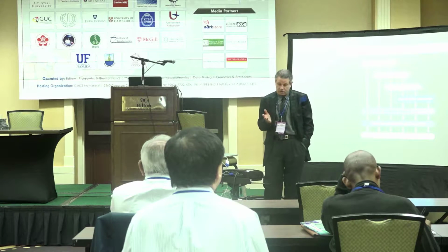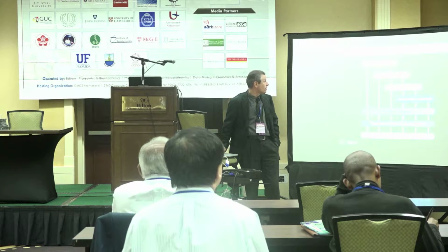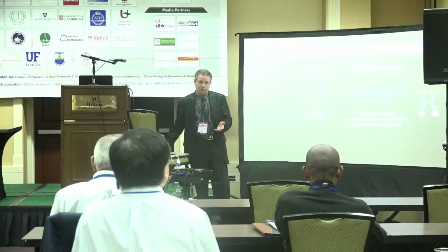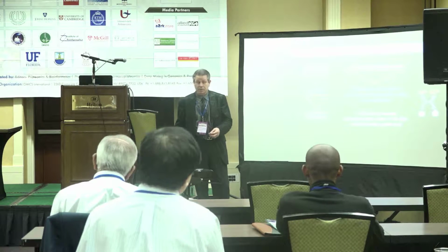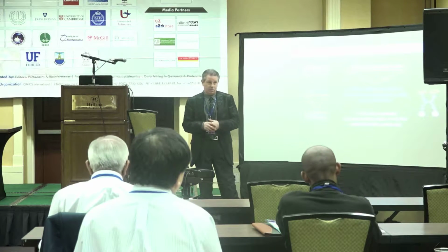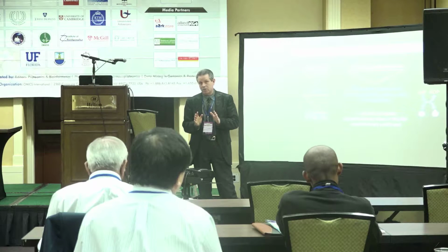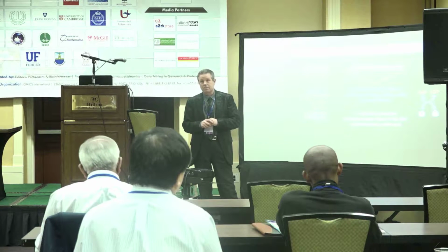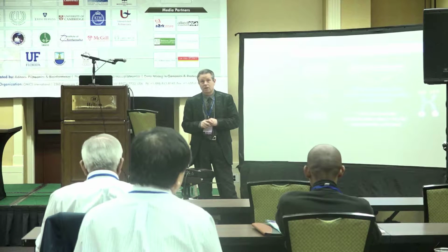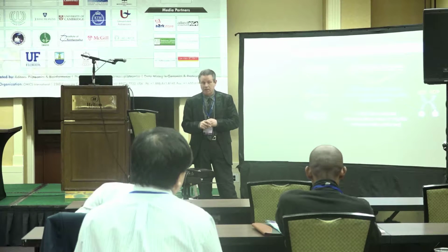And phosphorylation is a great way to go, because at the end of the day, whether you're looking at different classes of cytokines or receptors, we think of over 1 million sites. So this is very problematic when we're talking about mass spectrometry. In fact, mass spectrometry, I think, is a great tool for discovery of modifications of proteins and identifying phosphorylation sites. What's very interesting is that when you look carefully at the data by mass spec, this is probably best encapsulated in the PhosphoSitePlus database that Peter Hornbeck has pioneered.